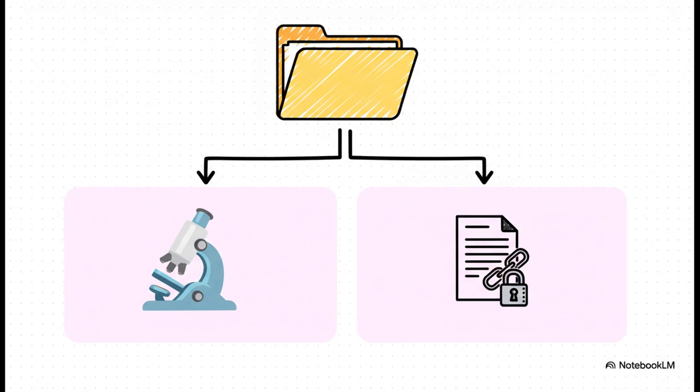The framework makes things immediately clear. For instance, a project might be something big, like developing a new cancer drug. An experiment within that project would be a specific task, like testing compound X on cell line Y. And then a case, well, that's for when chain of custody is everything, like in a forensics lab analyzing evidence for a trial. This simple distinction makes everything predictable, organized, and way easier to audit.